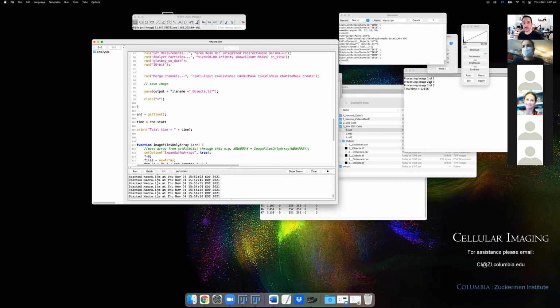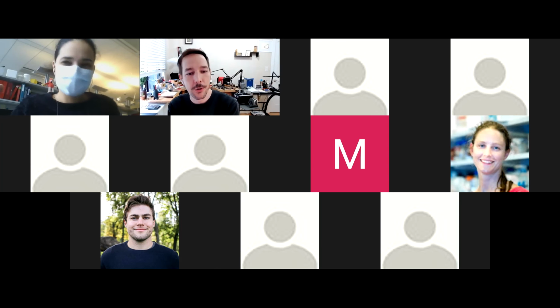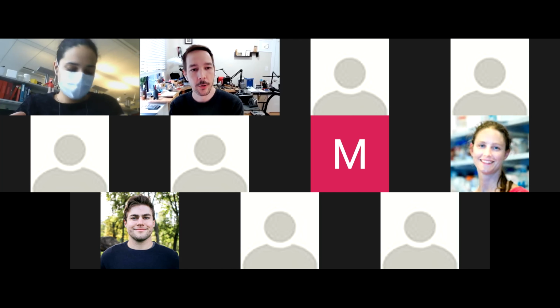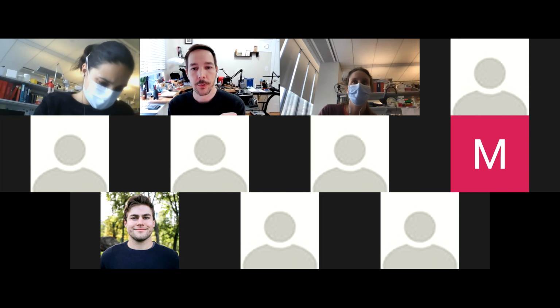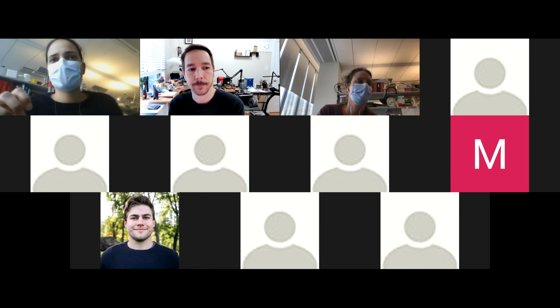And if we adapt something like this for what we're doing, and we can't get it to work, can you rescue us? Yeah, sure. If you're stuck on something, you can see how easy it is to get stuck and how often those are just simple things. So if you do get stuck, you can reach out. Also, there's the ImageJ forum, where many of these straightforward biological research questions come up pretty regularly. So that's a great place to go. If you just type it into Google, I'm sure you'll find something. We didn't go today into additional plugins, but if you're struggling with something, reach out and I can suggest a different tool that might work better.